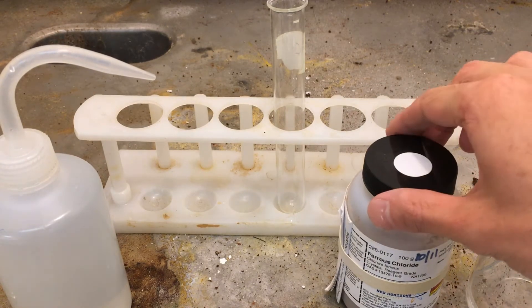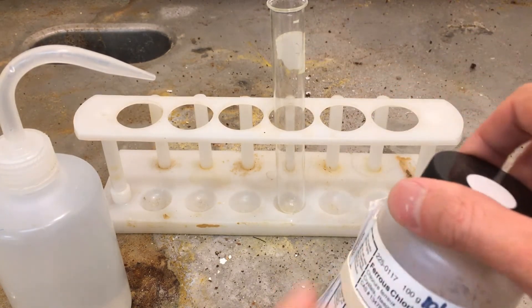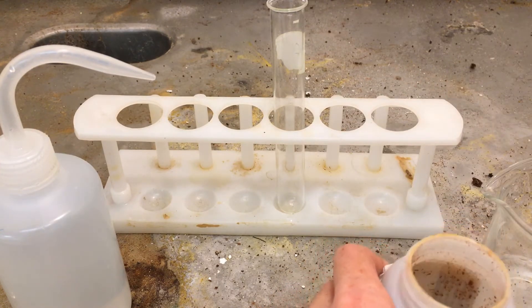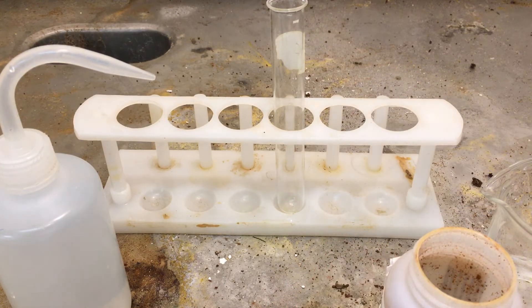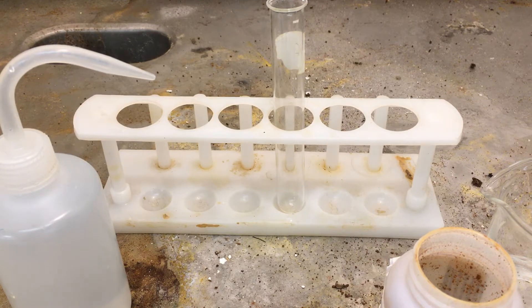We're going to start with this as a solid, dissolve it in a little bit of water, and then slowly add hydrogen peroxide. This is an oxidizing agent that will oxidize the iron from the plus 2 form to the plus 3 form.